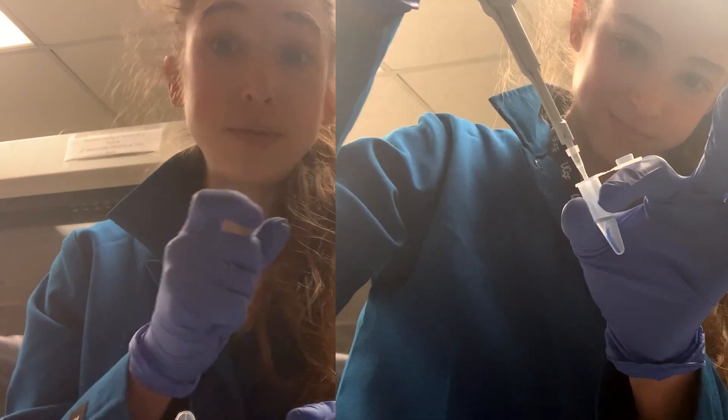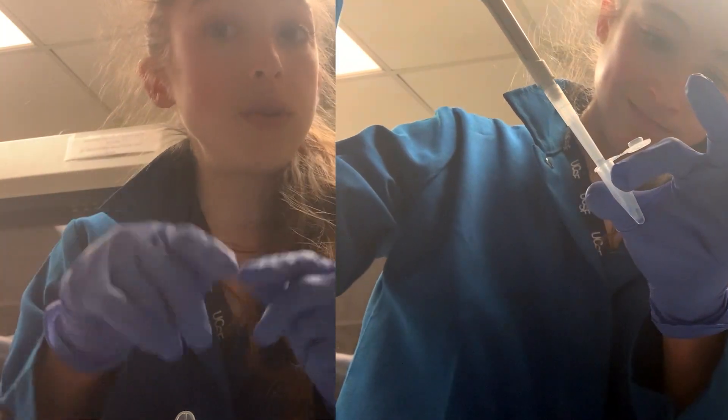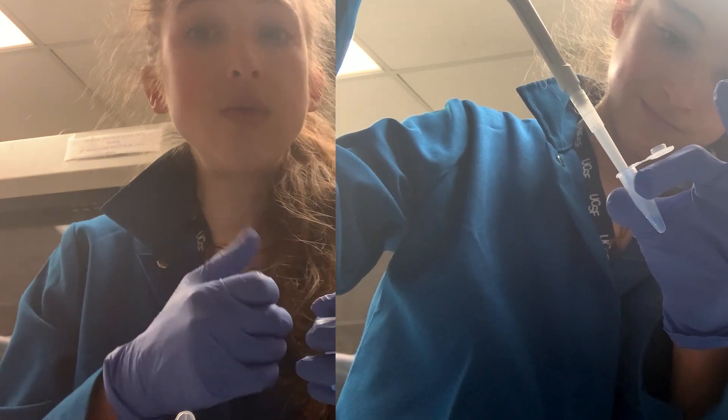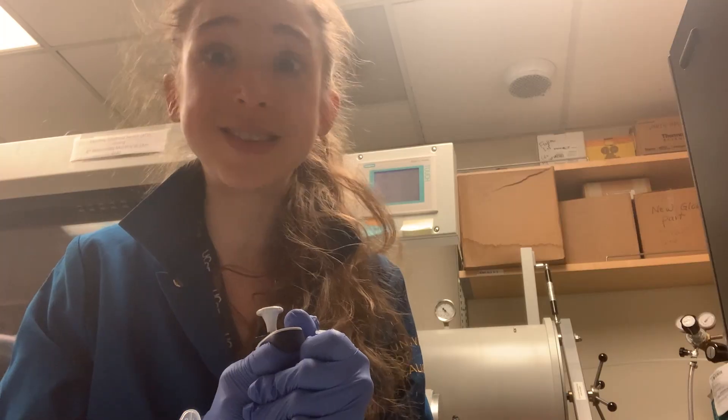Remember to use the bigger tip — not just the tiny tip — but set it to a lower volume than the volume you have in your tube. When you are pipetting up and down, make sure that you are not introducing air. Happy mixing!